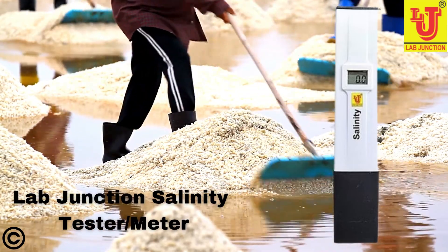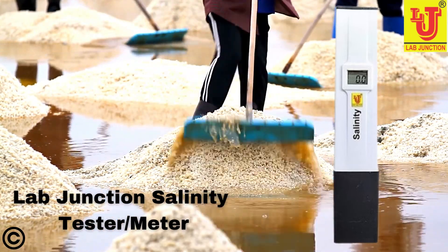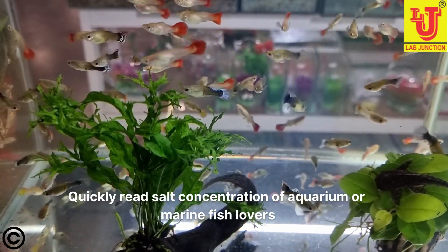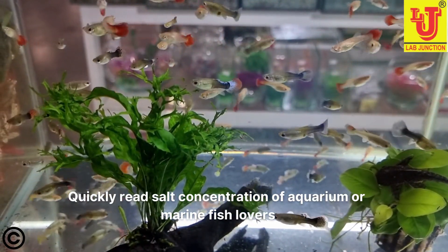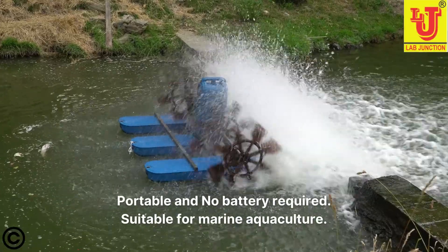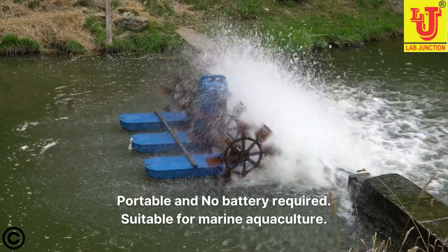The amounts of salts in water or soils are referred to as salinity. By salinity meter you can quickly measure salt concentration for aquarium or marine fish lovers. It's portable and no battery required, making it suitable for marine aquaculture.